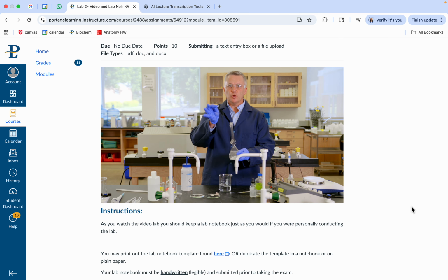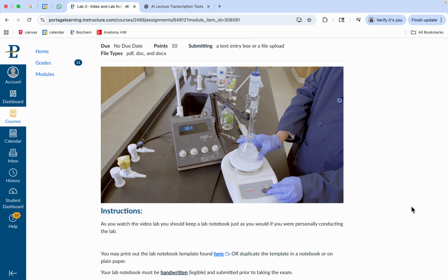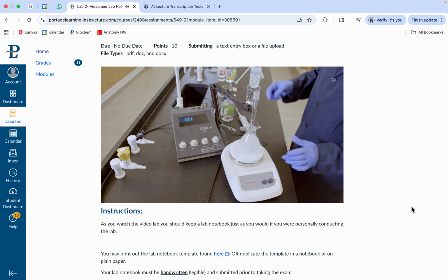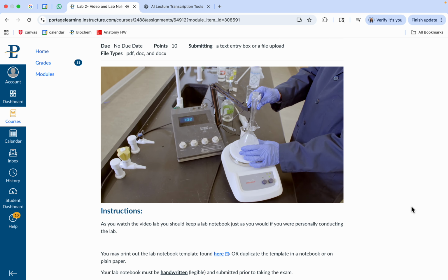And then we're also going to add a stir bar. We'll add that, and that'll help to mix it. So we're going to put it on a stir plate, and you can see it's already started to stir. And again, the idea is that there's a magnet in the plate that's spinning, and then there's also this magnetic stir bar. And we're going to turn this up and let this dissolve. While that's starting to dissolve, I'll show you what we're going to do with the pH probe.